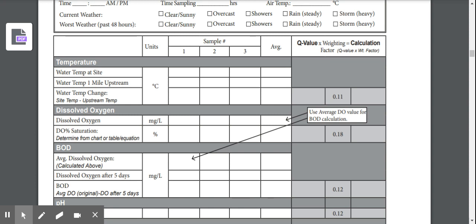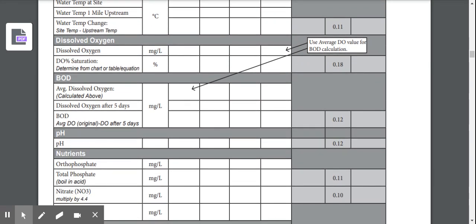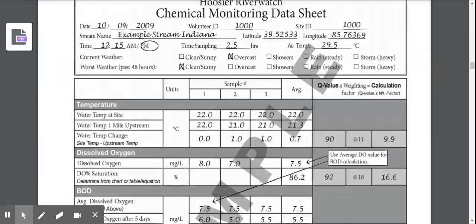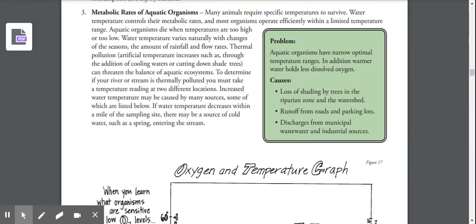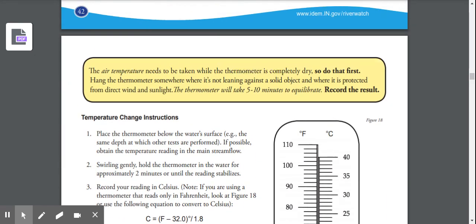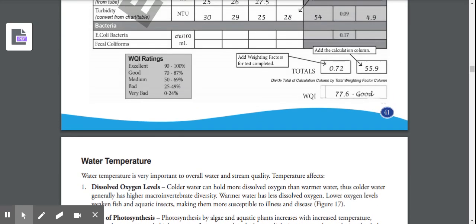Okay, we are collecting information on the different chemicals at the hospital. Our dissolved oxygen group was Brooklyn and Ali and Rocco, and we had our pH from you guys, nitrates and phosphates. So the way that this works is pretty much one, Brooklyn, Ali, someone in that group, does anyone know what dissolved oxygen indicates?